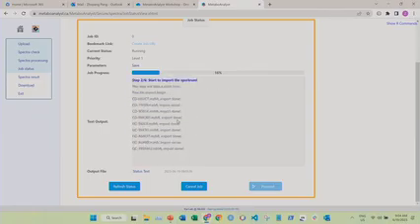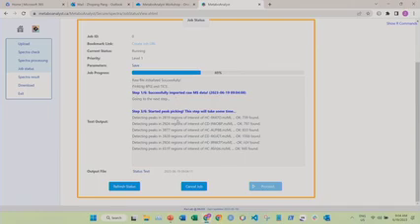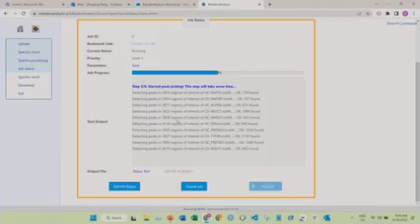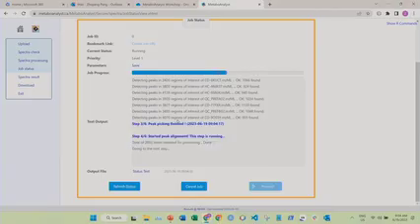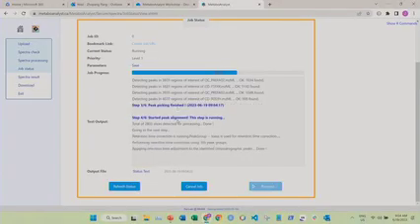Yeah, so MetaboAnalyst is designed for statistical analysis. So it's not just for spectral processing. Even when you upload data, we ask you to provide some replicates. In this case, we have like 4 control, 4 disease, and 2 or 3 QCs. So this is your sample plus the sample group information.